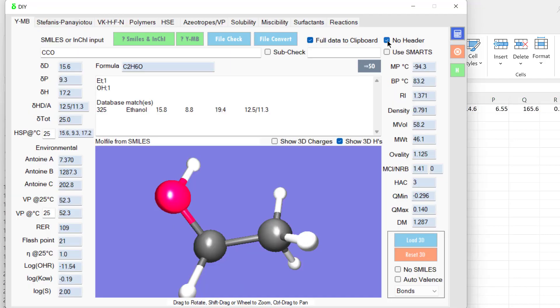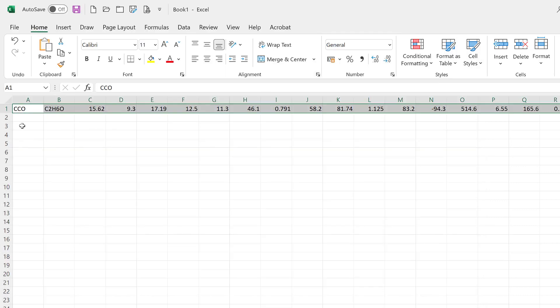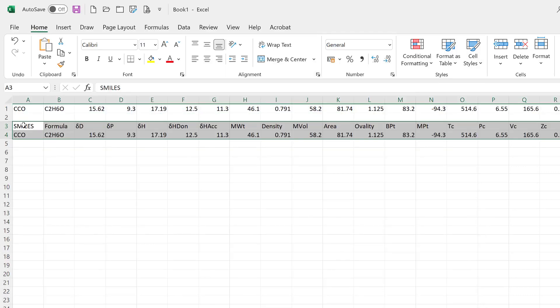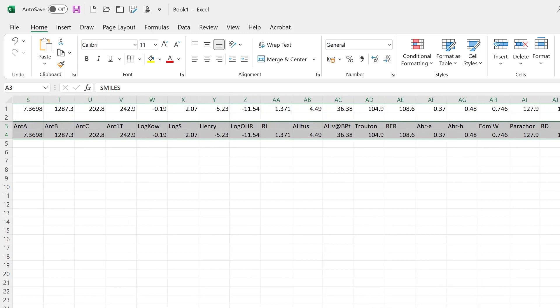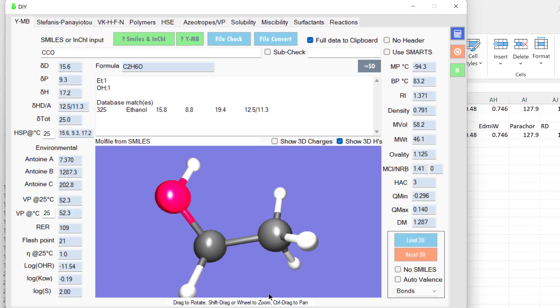So let's turn on the header and recalculate. And now do it again. Now we have the header and all the values stretching across the large range. So this is a powerful way of estimating HSPs but also other parameters.